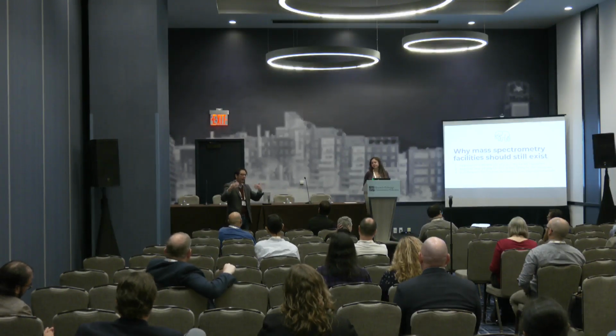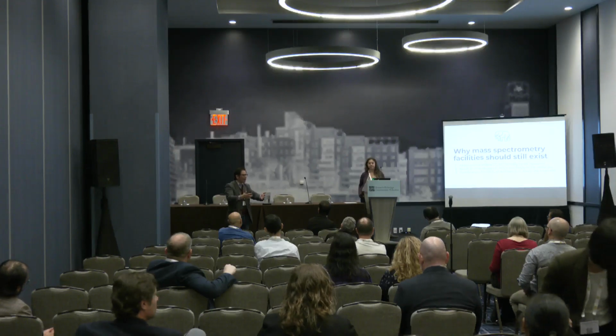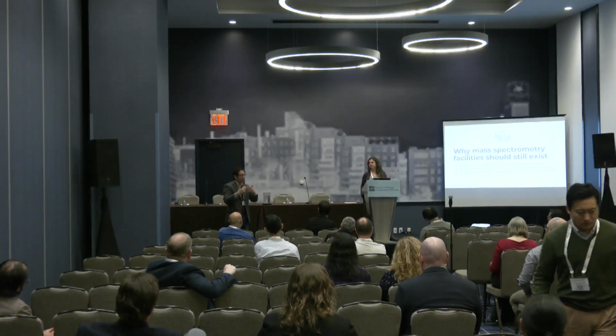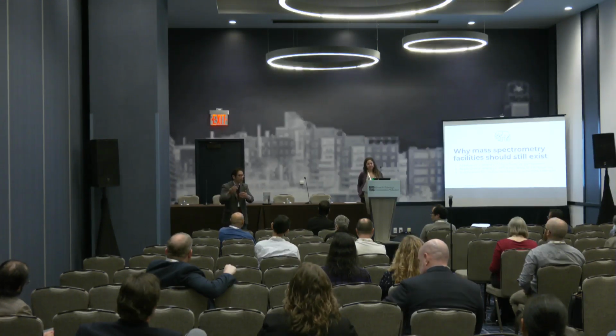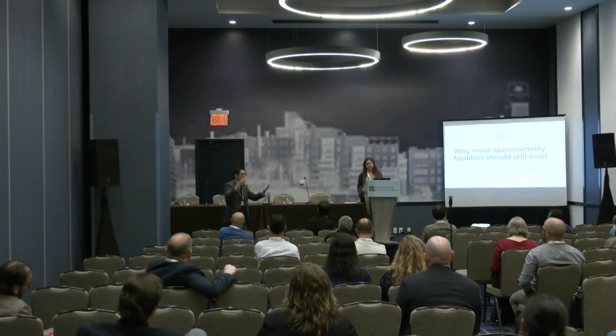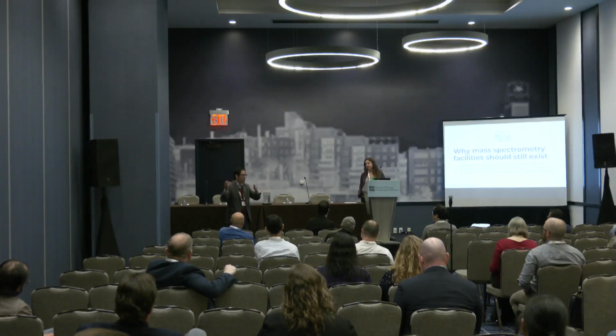Those things are what are critical for us to propel this forward as a collaborative environment, right? We can, as mass spectrometrists, show how good our methods are in our circumstance. And I cannot take a SOMA data set and tell you how good this data set is and which of these measurements are reliable and which ones are not reliable. But if SOMA were to open up some of the underlying measurements, let me vet some of the individual reagents on their own, then I might be able to say in those contexts what's going on, right? So there has to be this give and take on both sides.